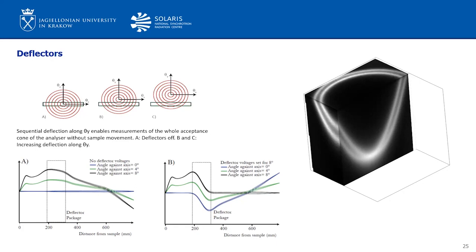In addition, keeping the experimental geometry fixed for the measurement sequence avoids matrix element effects which are caused by variation in the cross section for different photon-to-sample angles. So we can reduce this problem by not changing the geometry of the experiment.